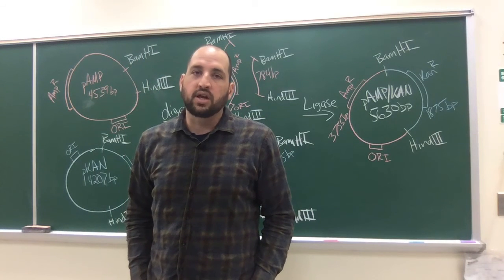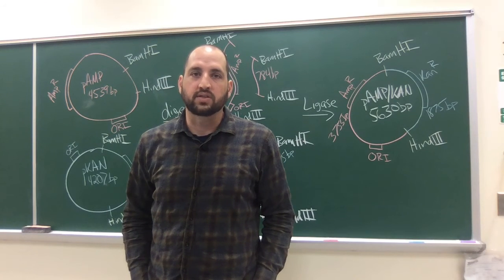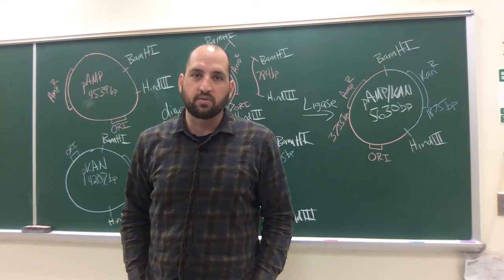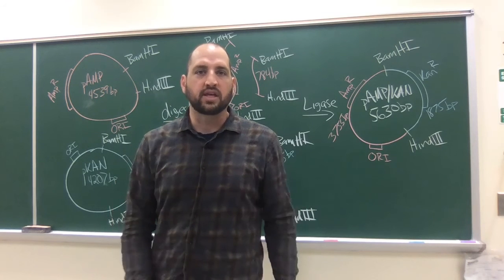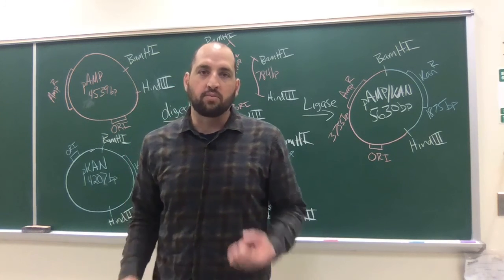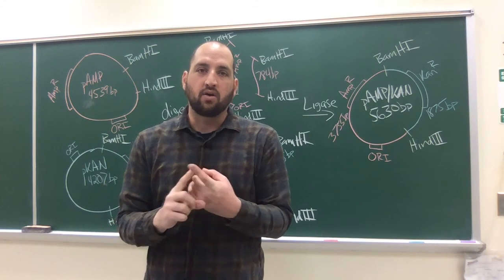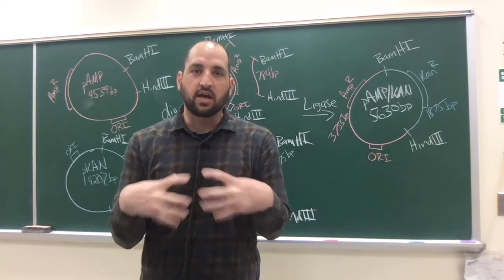We've included another video below that I think does a better job of explaining what's happening on a molecular level with these competent cells. They've got some pipe cleaners and visuals that I think help make this more clear than I could with a chalkboard. I'll refer you to that video that explains both the process of making cells competent using cold calcium chloride and also the process of heat shocking the bacteria so that they take up the plasmid.